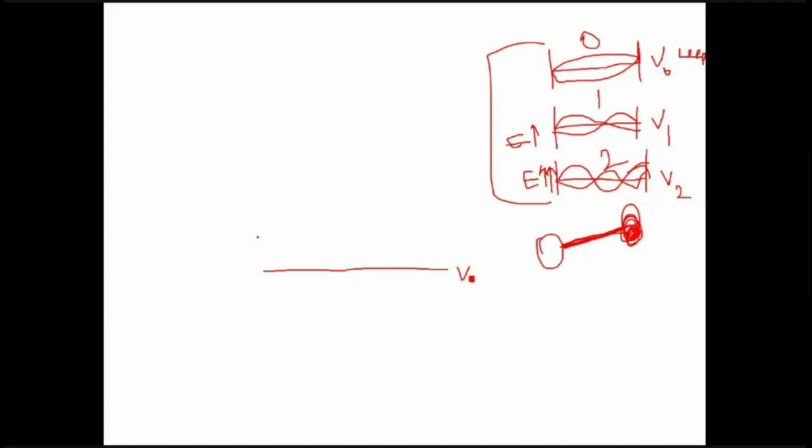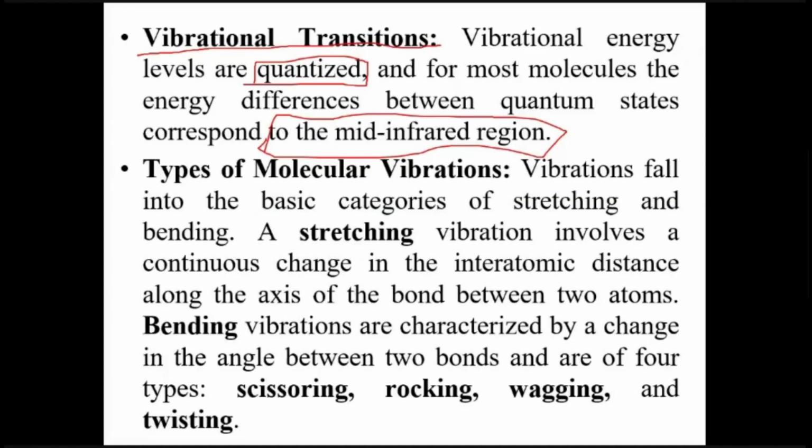It may absorb certain energy and jump to the next mode of vibration. It may absorb certain more energy to go into third mode of vibration. Now, have you understood this? There are different modes of vibration. Have you understood so far? Few students are saying yes, they have understood. Okay, good.